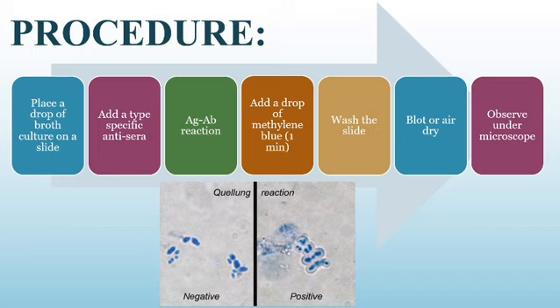This antigen antibody interaction increases the size of the capsules, so they can be visualized clearly under the microscope. Due to this specific interaction, this is considered the gold standard method for the detection of highly refractile larger capsules around microorganisms, compared with the other two methods discussed earlier.